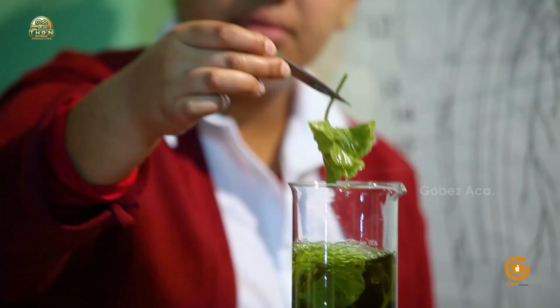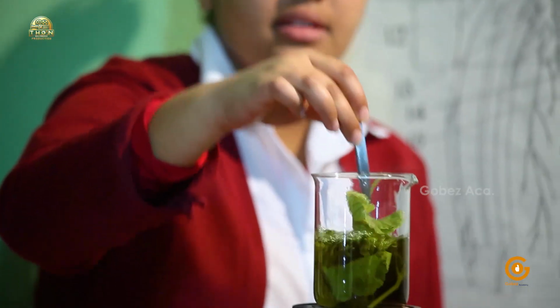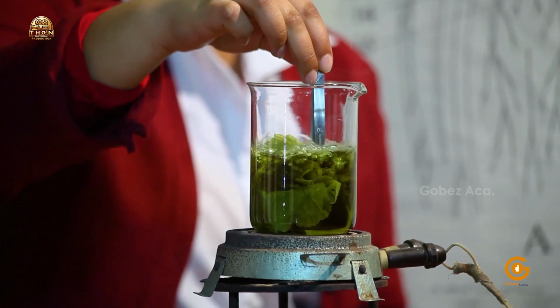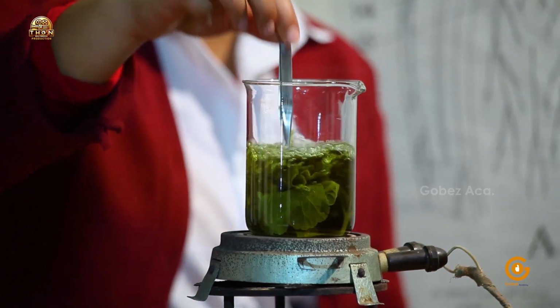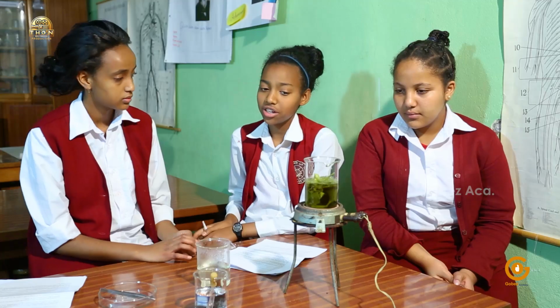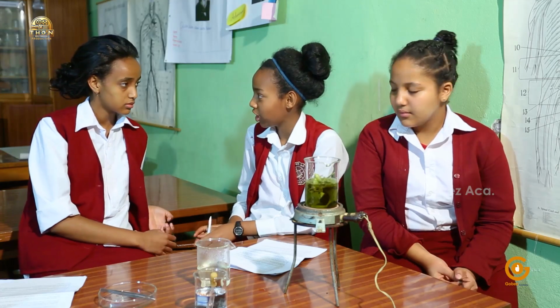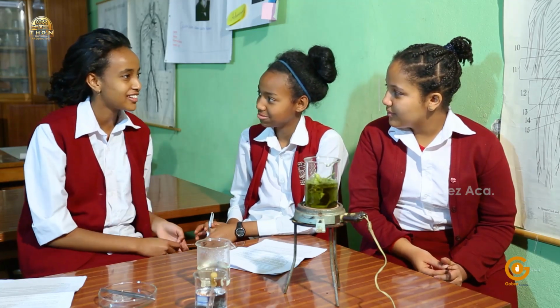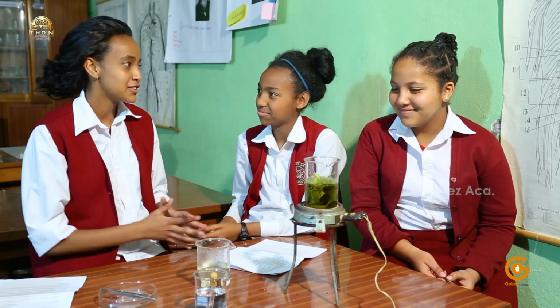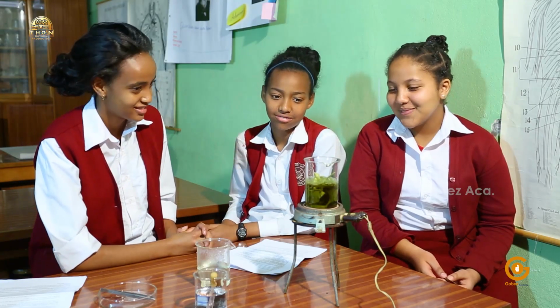Do you think it's enough? I don't think so. We should wait. We never heat ethanol on an open flame. Do you know why? We already said that. Because it catches flame, right? Yes.